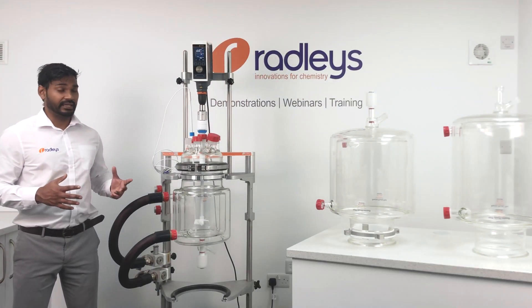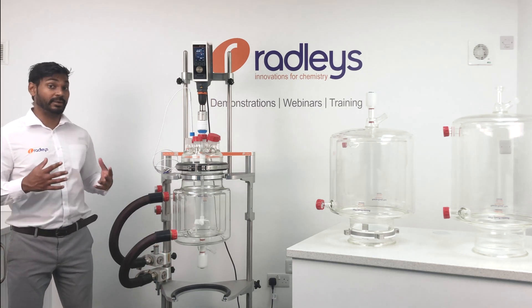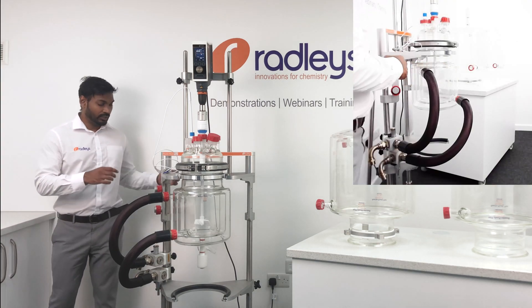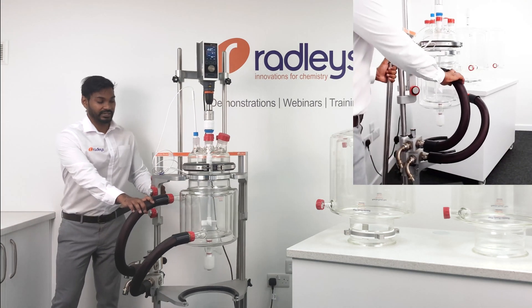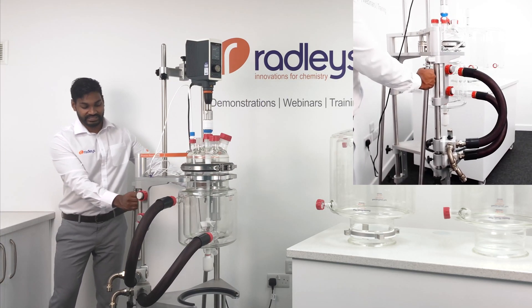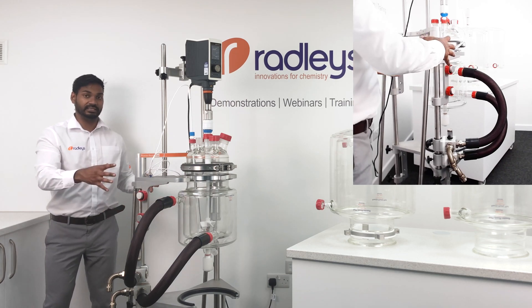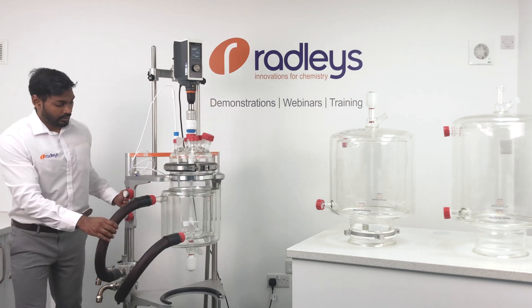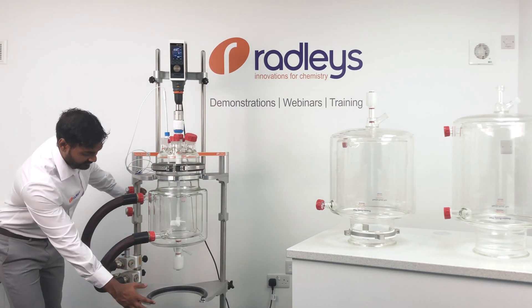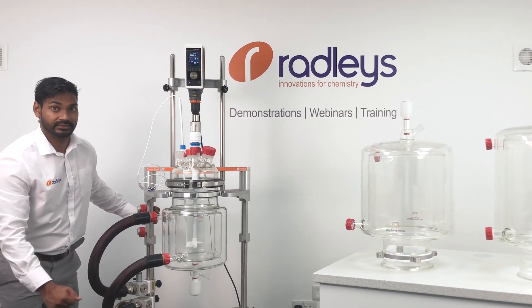In order to use the 30L and 35L vessels you'll need the bottom support, which is compatible with both new and existing Reactor Ready Pilot systems. Our framework is called the Reactor Ready Pilot Core. It's quite sturdy and stable and features brace bars which add additional cross-bracing to the system when the vessel is loaded in. The framework is quite open from the front, giving you easy access to the bottom outlet valve in order to drain your vessel contents after your reaction.